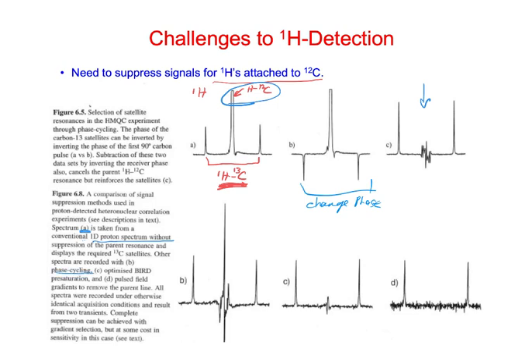B is what they call phase cycling, and they don't do this so much anymore, but usually in these experiments, to suppress some of the noise, they didn't always pulse on the X and detect on the Y. One time they'd pulse on the X and detect on the Y, and then pulse on the Y and detect on the Z, cycling through all the different phases of pulsing and detection. This would allow them to subtract out or cancel out some of the noise.